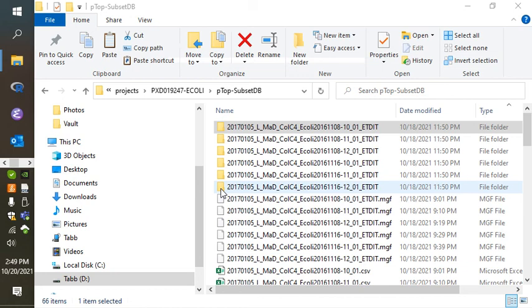And welcome back to the demonstration on how to deal with pTop results, and how to use pTop in your top-down database searches. Through the magic of computing, I have transported you to a moment when our search has finished. Now, I have all of these output files that came from the software. I thought it might be worthwhile to try to walk through them.